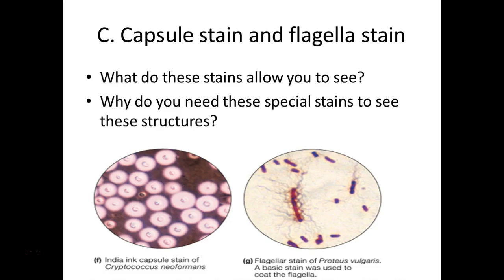No, because all staining does what? Kills them. So you can see when they were alive that they were moving around because, look at this guy, he's like Cousin It from the Addams Family. He's covered in flagella. I mean, he's just covered all over. Proteus vulgaris. He smells vulgar too. That's probably how he got his name. E. coli's like this too, though. He's just covered in flagella. Just covered in it. So he can really motor.